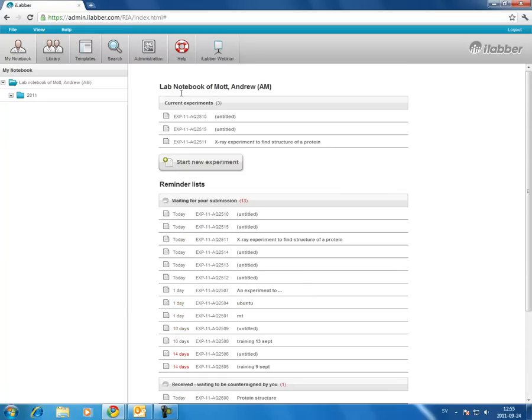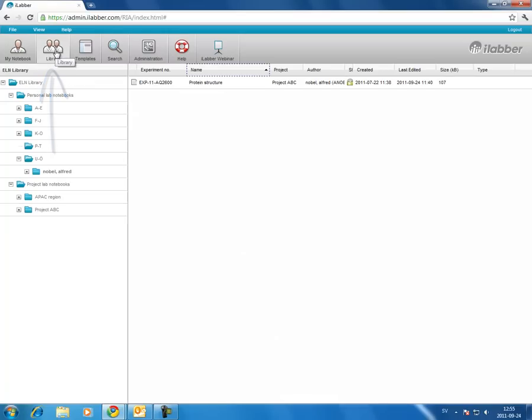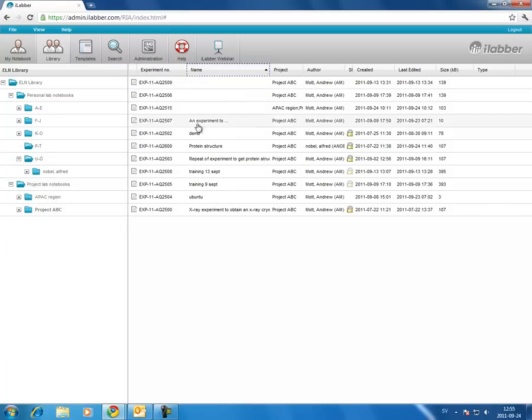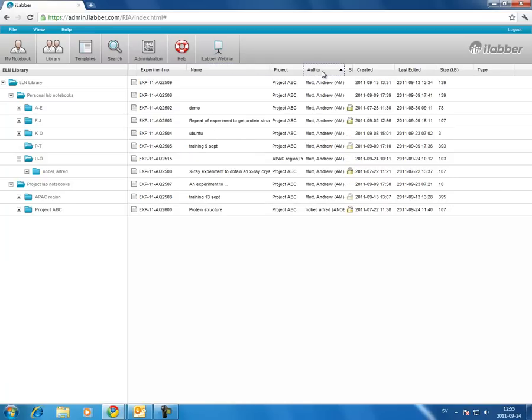The next tab is the library, and here you can find all experiments sorted either by person or by project. You can click on a project and see a list of all of the experiments in that project, and these lists can be sorted by clicking on the title bars.